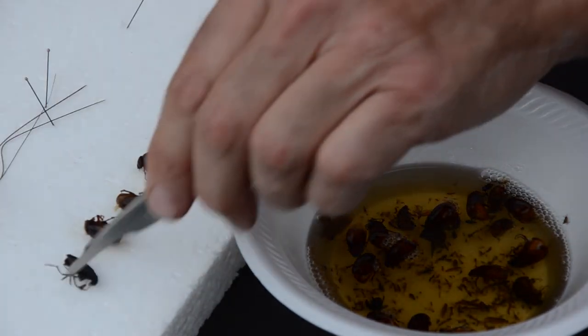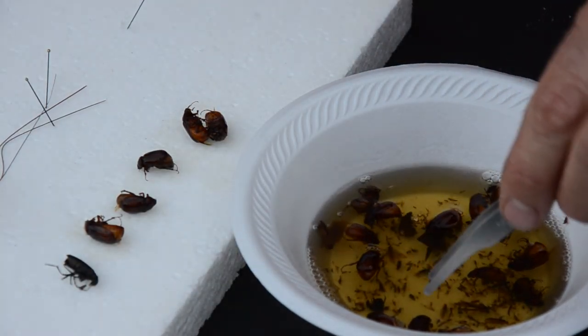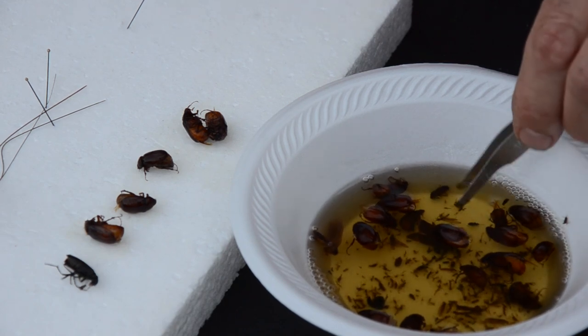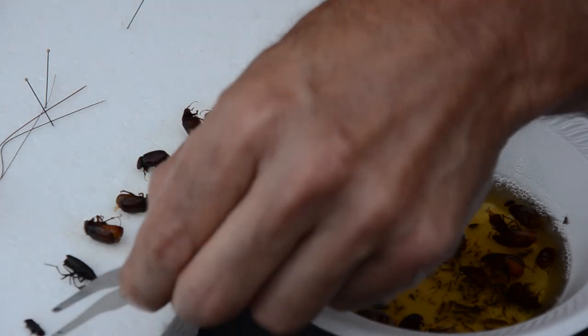Here's a moloid beetle. So lots of scarabs and moloids — very, very nice. Here's a homopteran. We'll pin a couple of these right now, real quick. I'm going to pin this beetle.